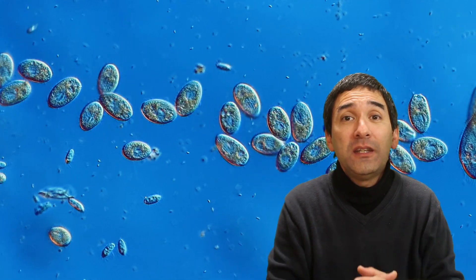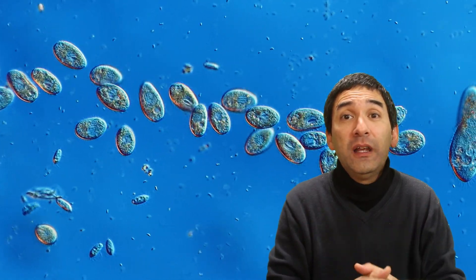Both ciliates and bacteria in this video here have now moved to the edge of the cover glass where there is most oxygen. And this is also the place where they meet, and this is also the place where now the feeding frenzy takes place. You can see how the ciliate is swimming into the bacteria and how it's able to suck them in.